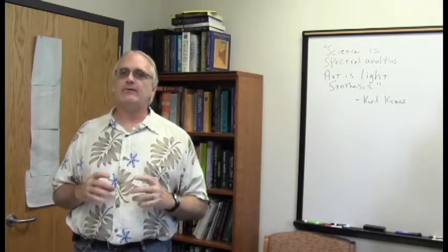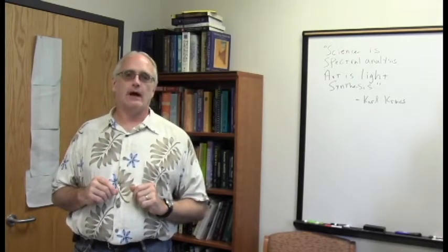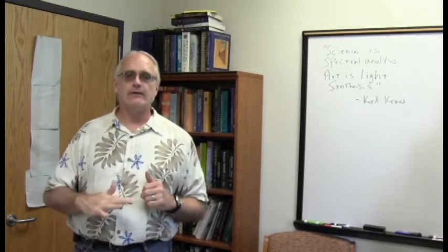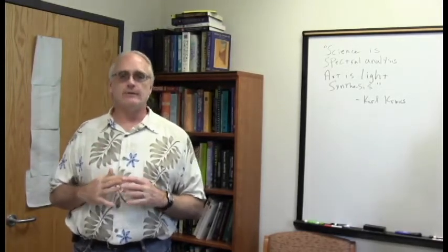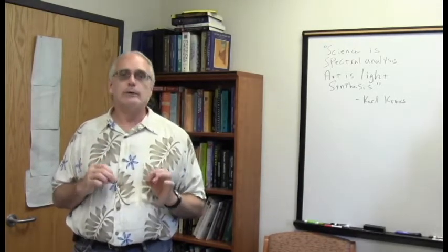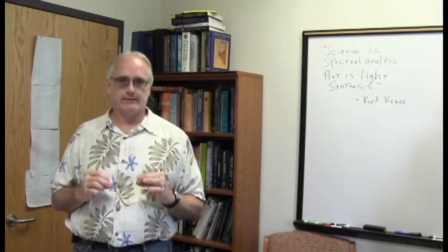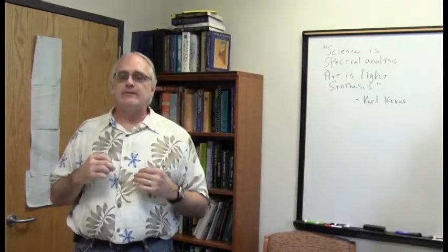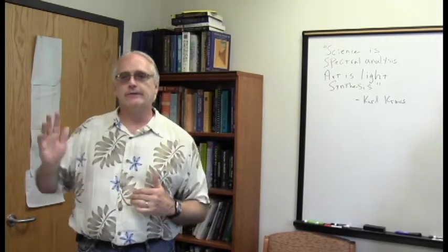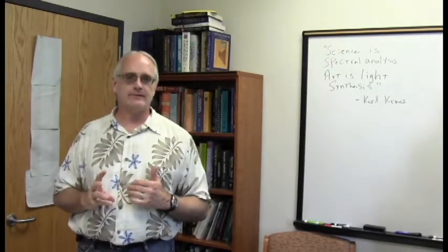That has the effect of taking every one of the protons in any molecule we have in there and forcing them to oscillate between all of their possible spin states very rapidly, about 400 million times a second. What that means is the instrument acquires a carbon spectrum while all the protons are oscillating between all their spin states.